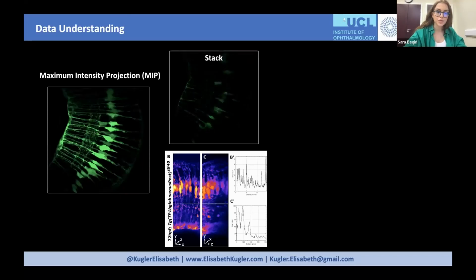And just to orient you guys, this is the apical region of the cells, and these are the basal end feet. So it's a bit like upside down. All right, so now we know kind of what we're looking at, but what should we look for if something is going wrong? What should we inspect for?